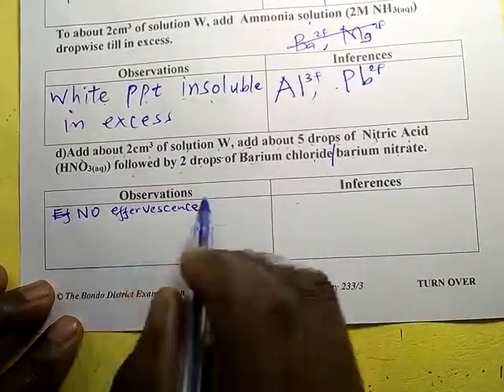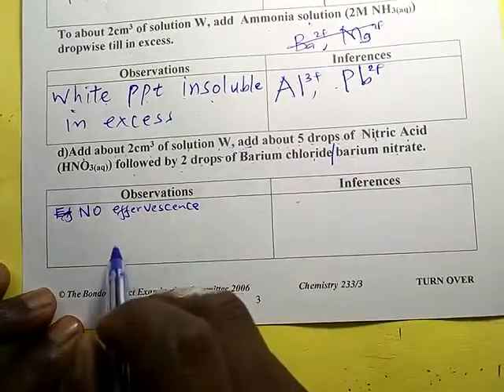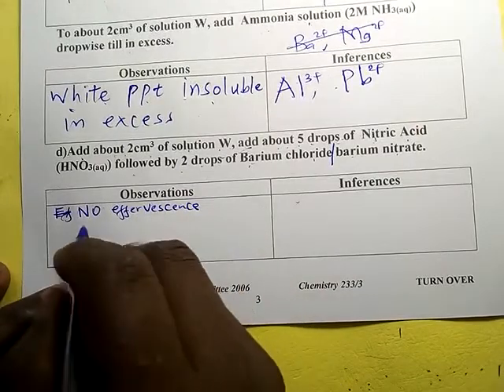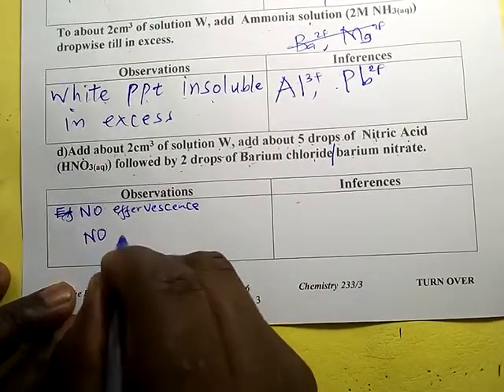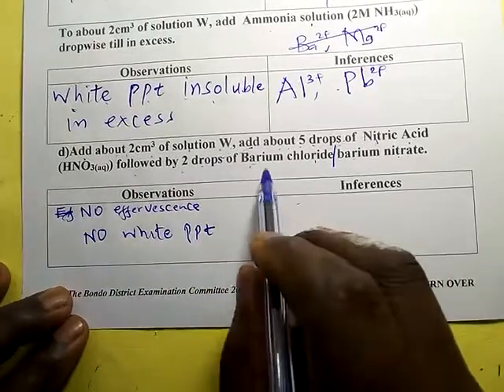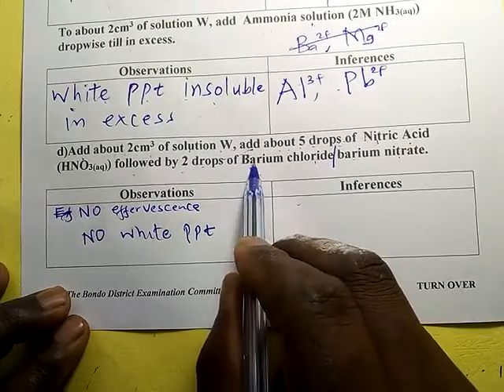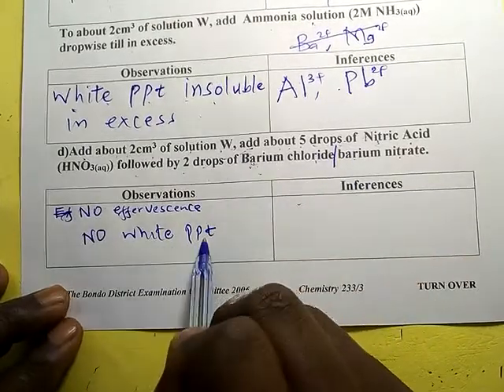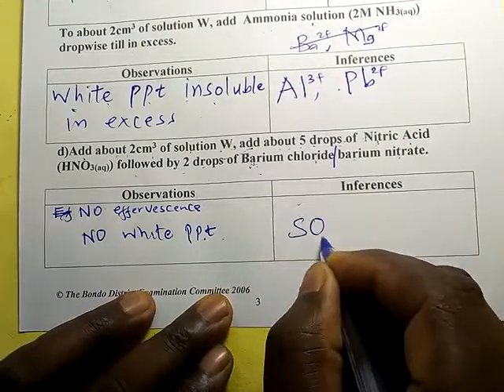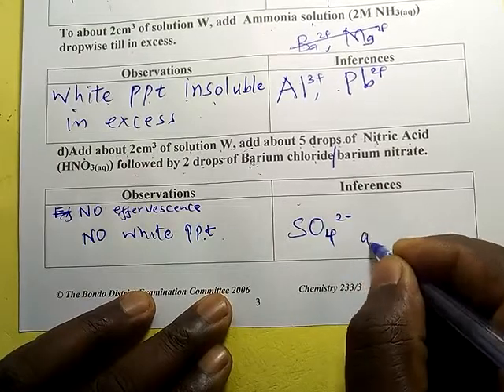You don't have to infer. That's the observation you have made. There was no effervescence because you expected effervescence, and then no white PPT because we expected a white precipitate to form with barium ions. So if there is no white PPT, it simply means that the sulfate ions were absent.